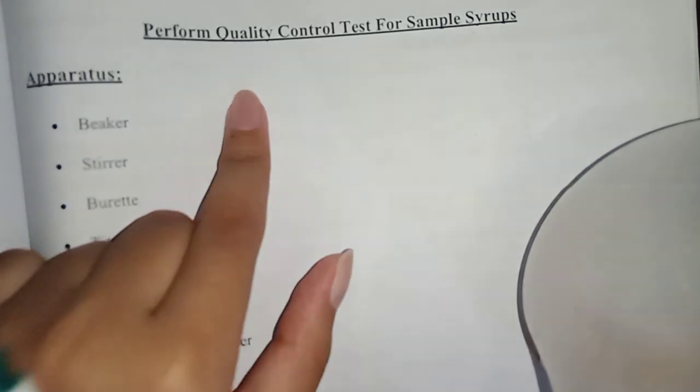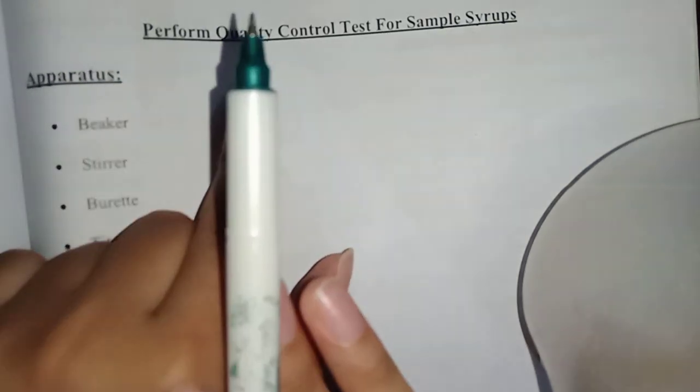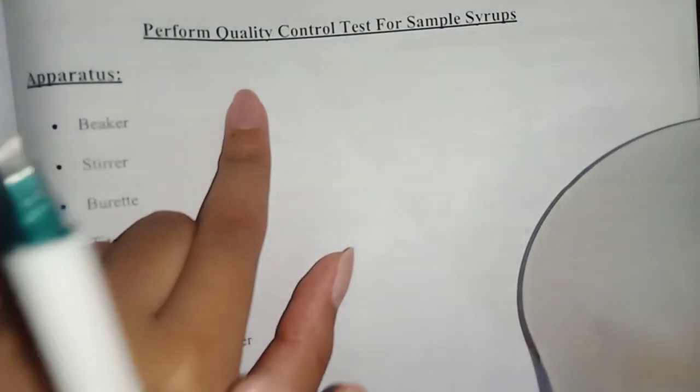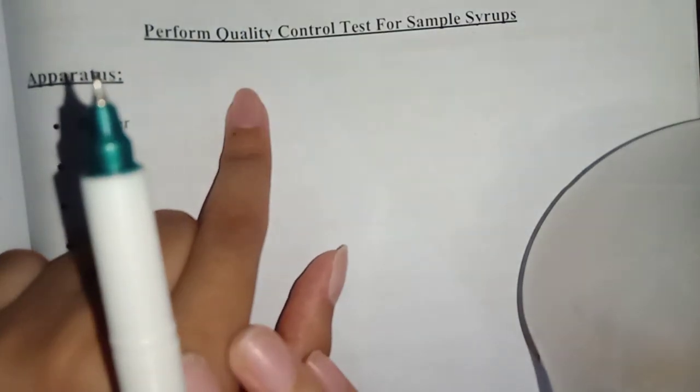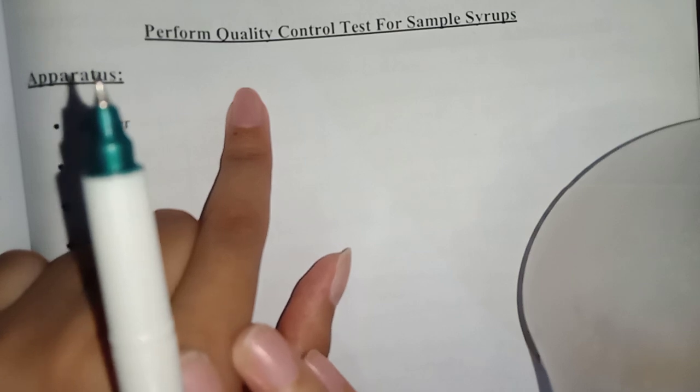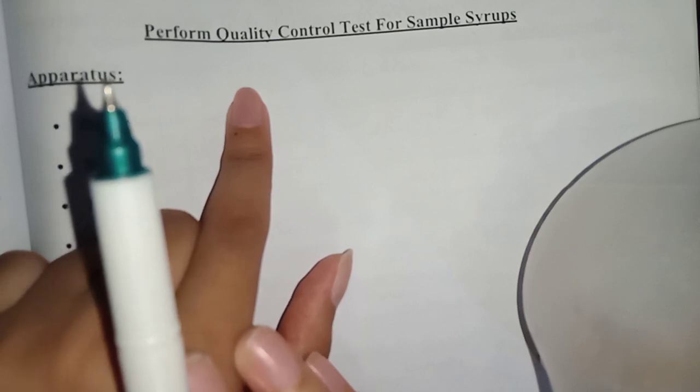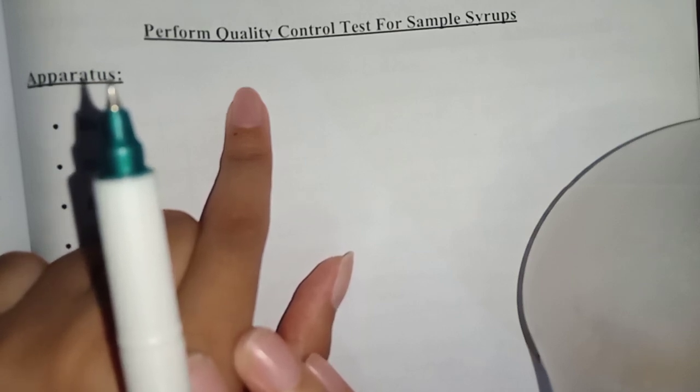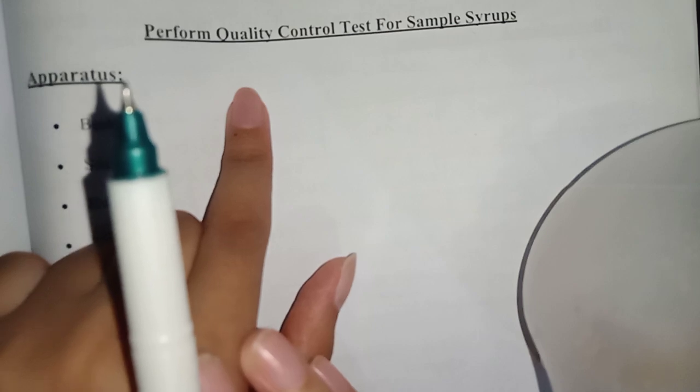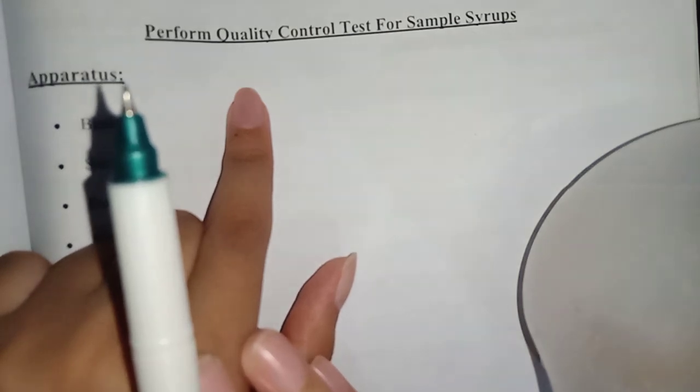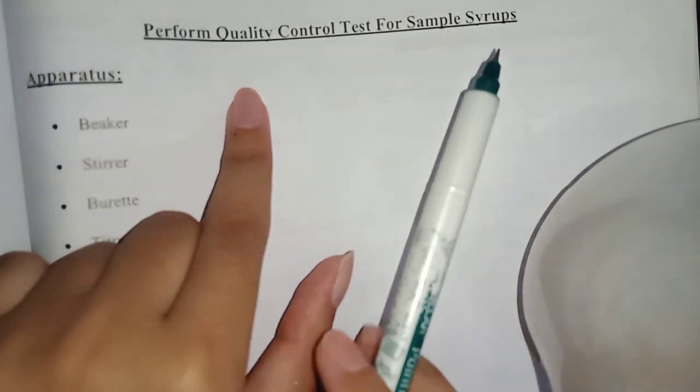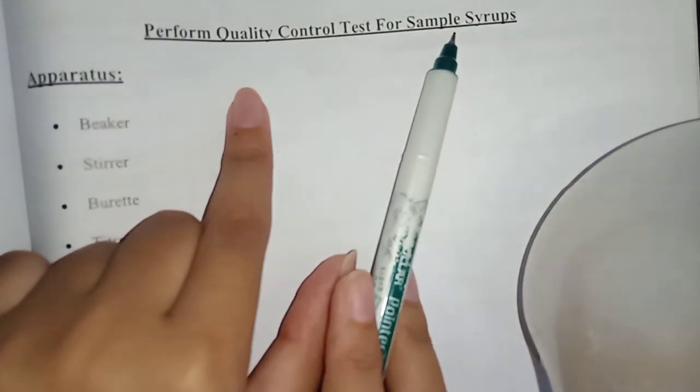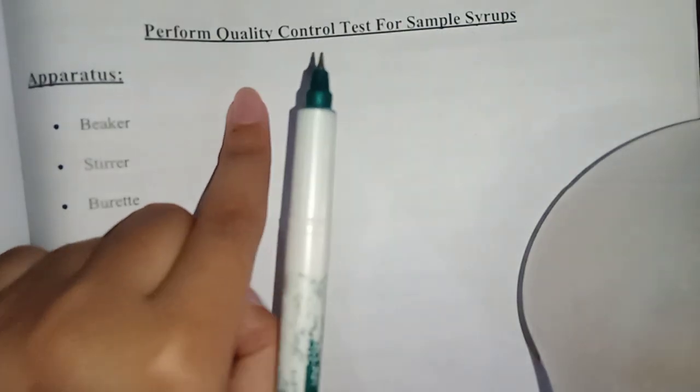Before we started, we didn't have any test for it. So this is our first test. There were tablets, capsules, suppositories, and parenterals. So this is our first test for syrup.